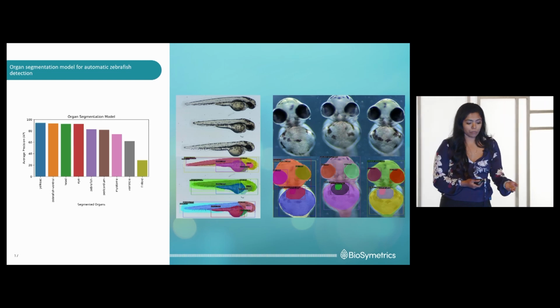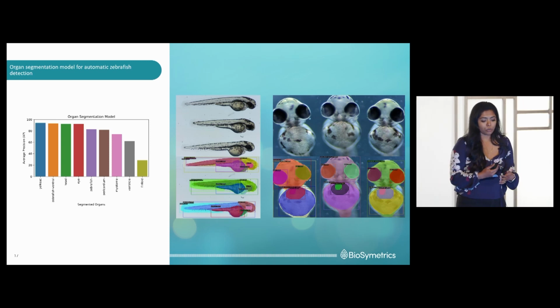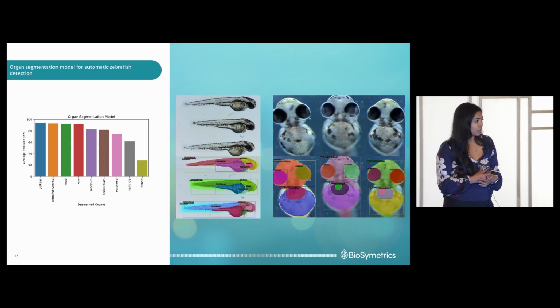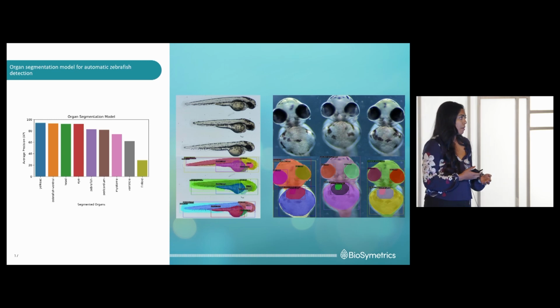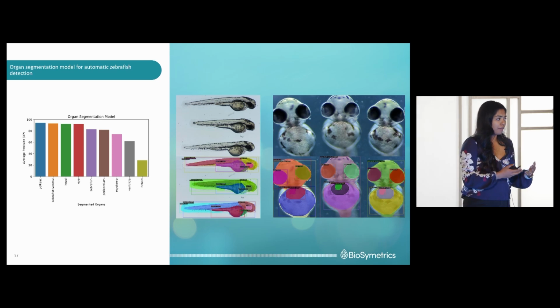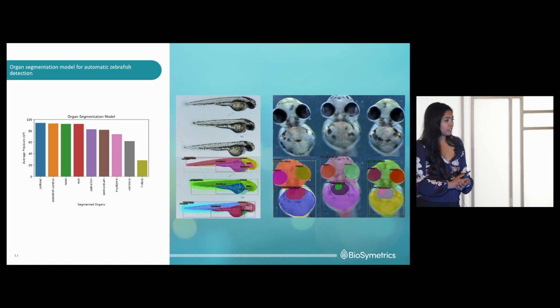However, there is some improvement. Things like the myotome, the finfold, were scored lower, and this is something that we do need to improve upon. But for the aspects of this project, we were more invested in the yolk sac, the zebrafish, pericardium, those regions, and that's why we continued onwards.